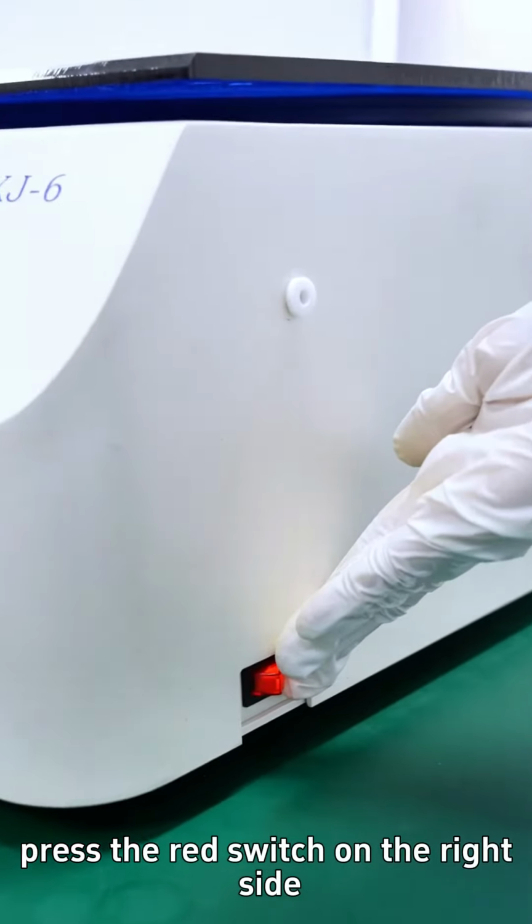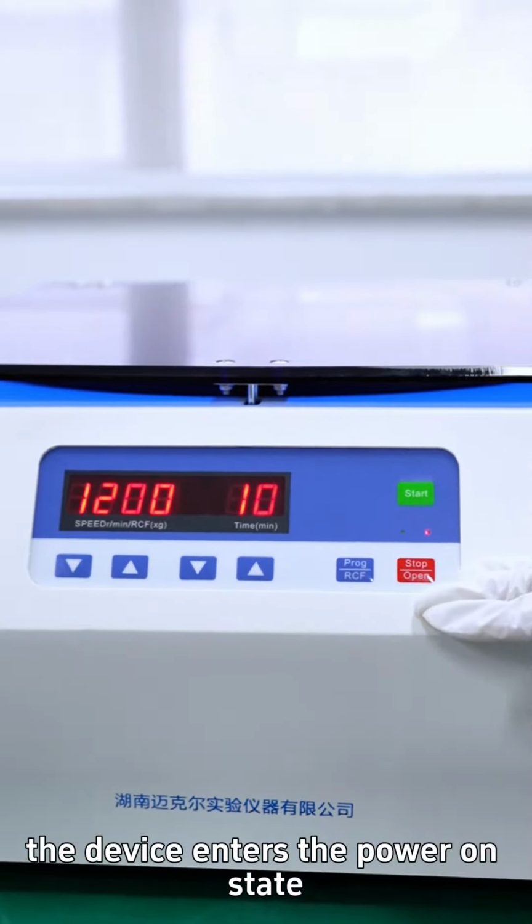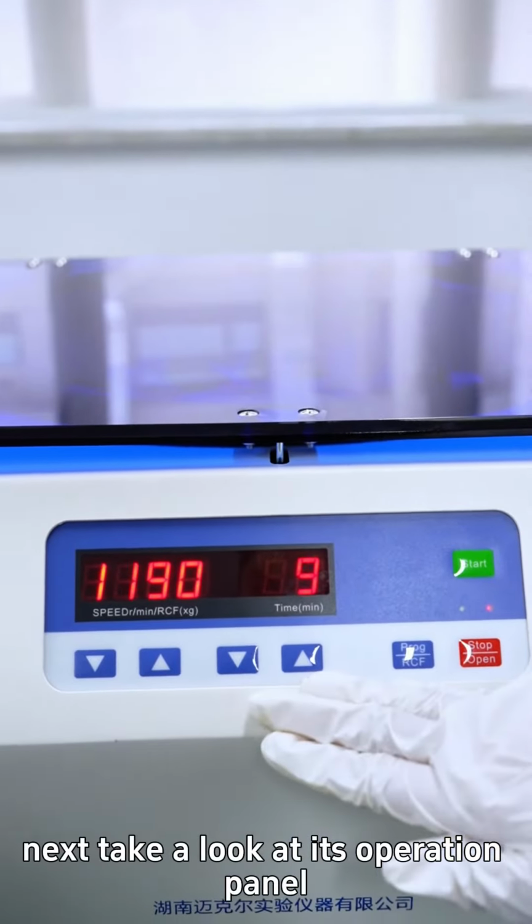First, turn on the rear power cord. Press the red switch on the right side. The screen lights up. The device enters the power on state. Next, take a look at its operation panel.